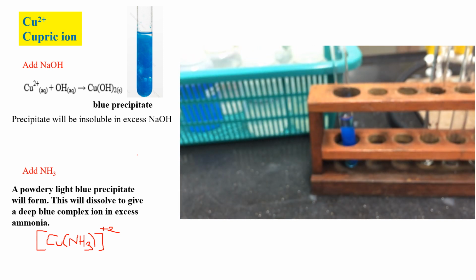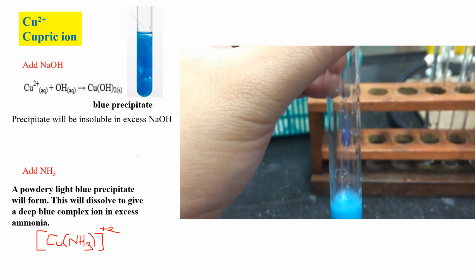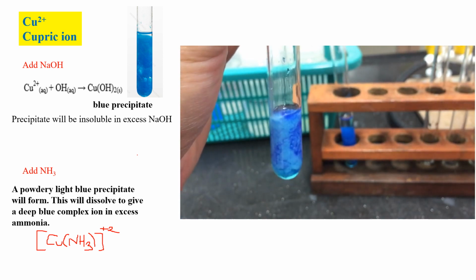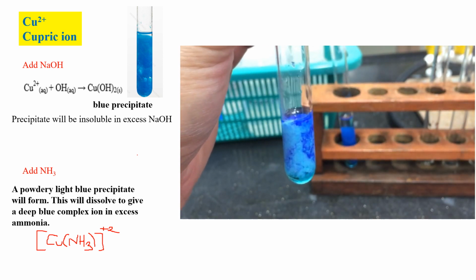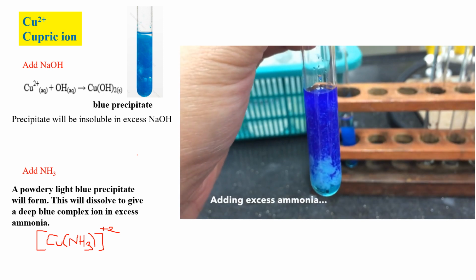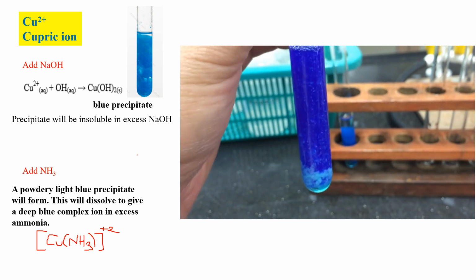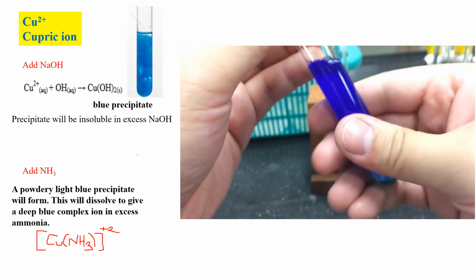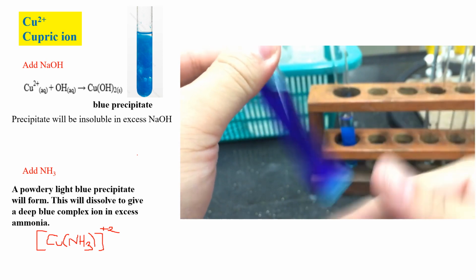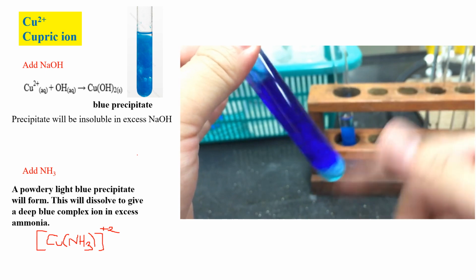To the light blue precipitate, add an excess of ammonia solution. You will notice that some of the light blue precipitate starts to dissolve to give a deep blue solution. Give the test tube a good shake to ensure thorough mixing.